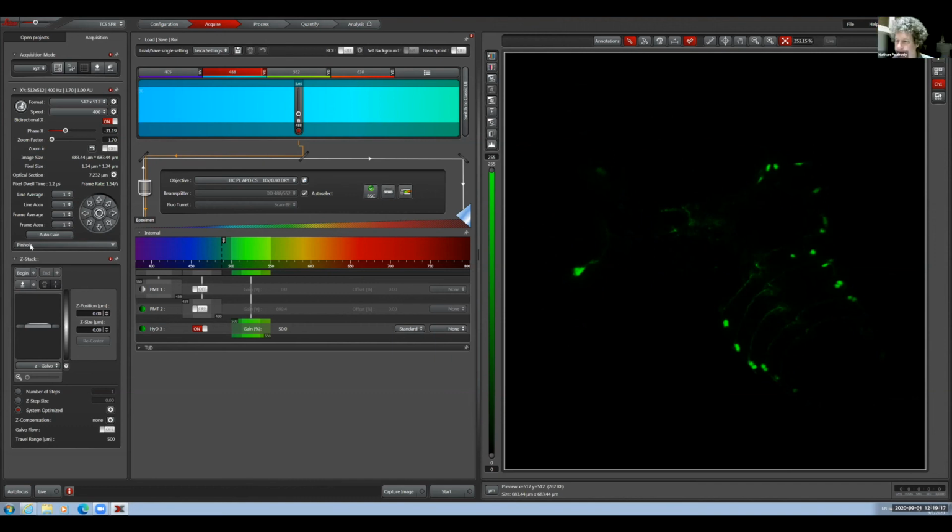Okay. Because that'll probably happen with my students too. But I'll just make sure we're patient with that. I was going to say that it will make it tricky for them to control a lot of it, just because you have to click and wait and see what it actually does. Right. But I can also just have them tell me what to do. That's not even necessarily bad if they have to keep saying the words. Right. Because the more you say the words, the more it clicks in that that's what it is.